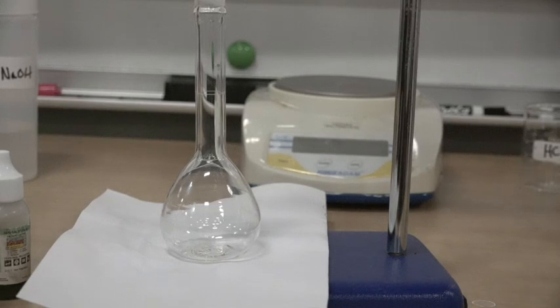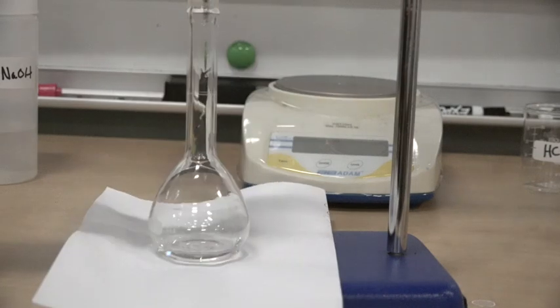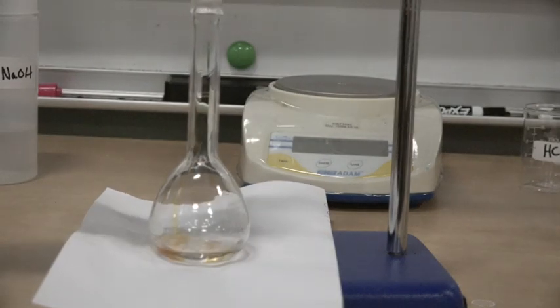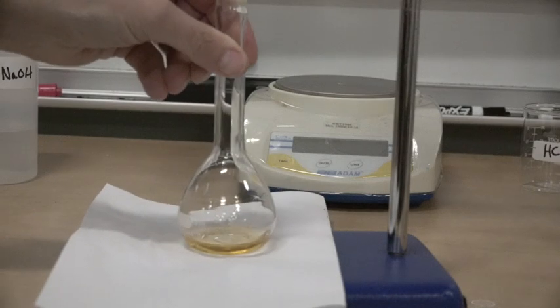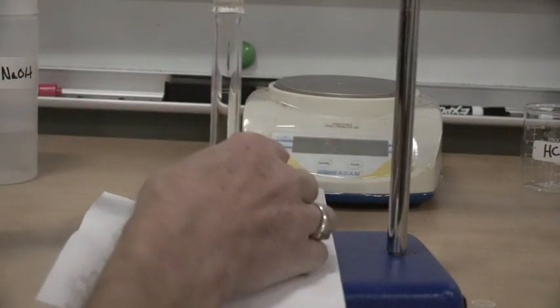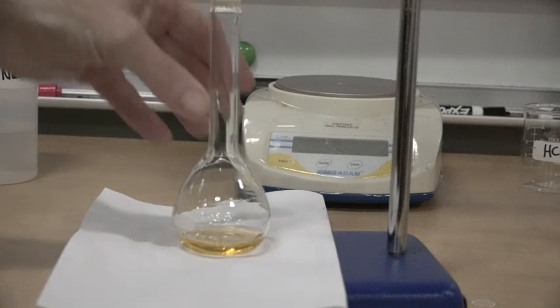So here we go. Here's 10 mils of the HCl, unknown molarity. Now we are going to put the bromo blue in. It should turn yellow. And there is the yellow for an acid. Now, we are going to start pouring the base in.